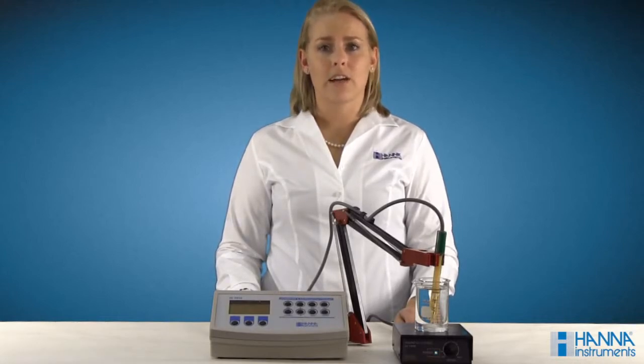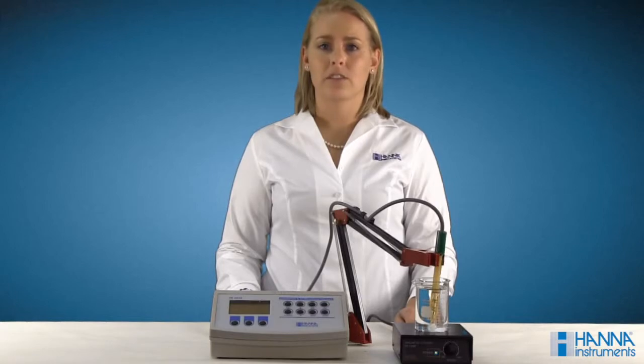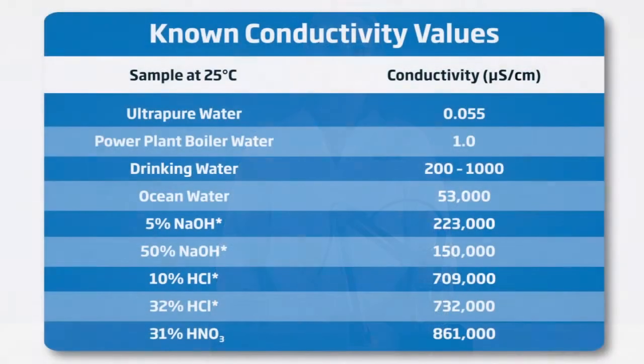Almost all standards account for calibration to occur at 25 degrees Celsius. Therefore, compensation must be made for any measurements made at temperatures other than 25 degrees Celsius, unless the user is attempting to indicate the actual conductivity, or the conductivity of a solution without the temperature compensation.